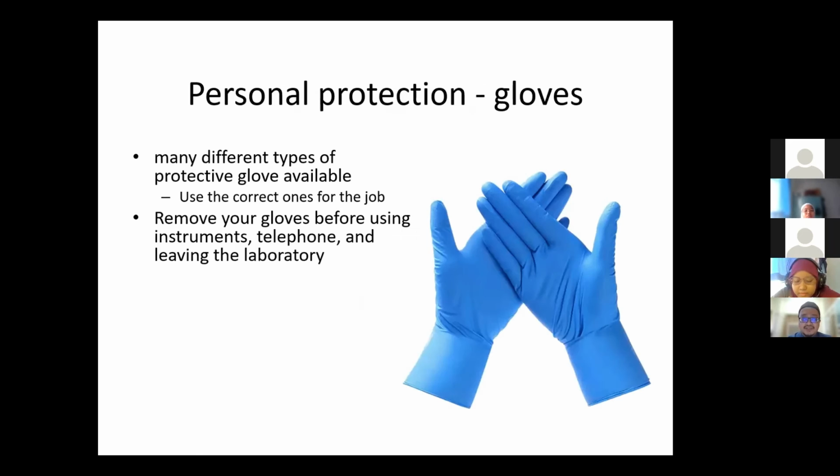Okay, personal protection: gloves. There are many different types of protective glove available, and as part of the risk assessment, OSH, macam-macam lagi act yang lain lah. Okay, if you use the correct one, you'll be agreeing to those acts and SOPs. So basically, just use the right one. Yeah, you will conform to many requirements.